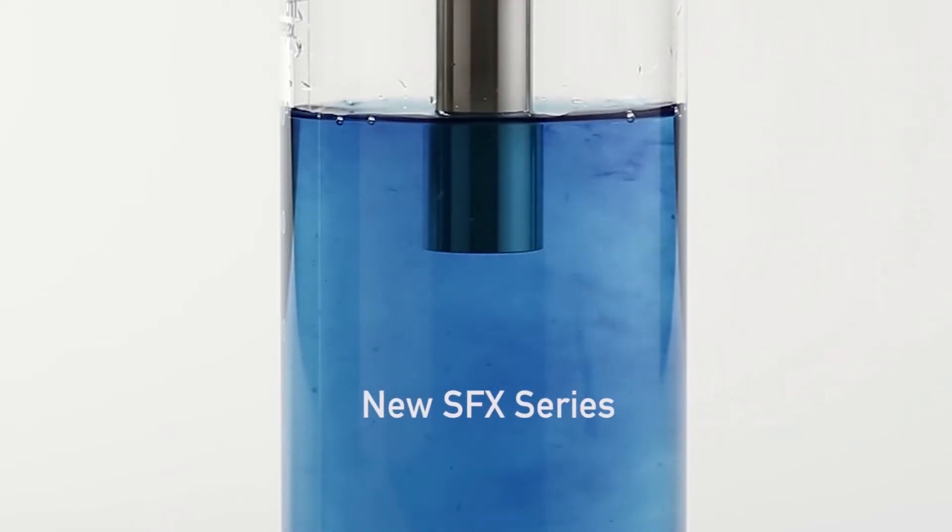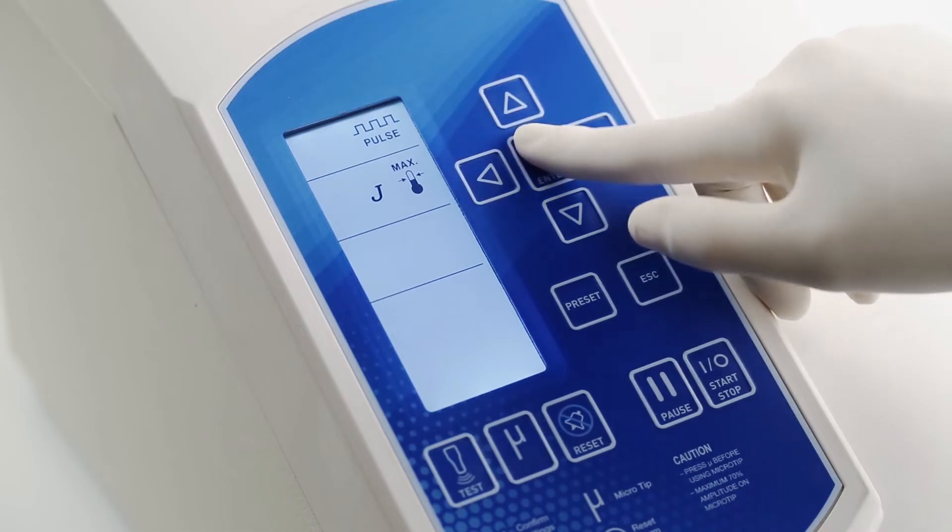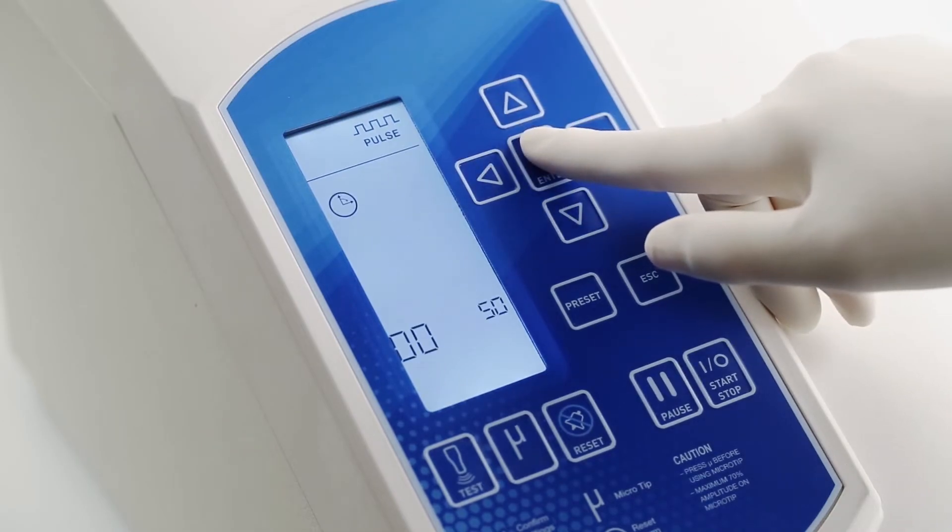Now Branson is setting a new standard with the SFX series. They're simpler to use with digital controls and an easy to read display that shows the parameters and progress of your experiment.